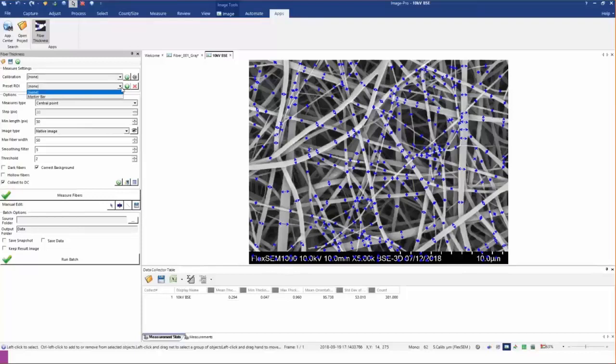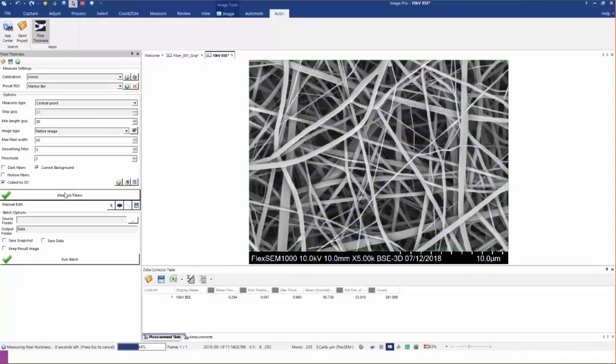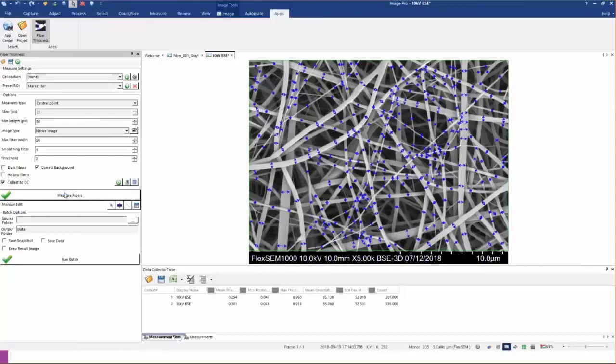Here I've already defined an ROI. It's literally just drawing an ROI across the area you want and then adding it. I call it marker. I'm just going to recount. And now an ROI is automatically placed and all of my analysis is already taken care of. To show the editing, I can clear the data table anytime. And I can actually edit. So if I needed to do some more editing on this, I can easily do that.